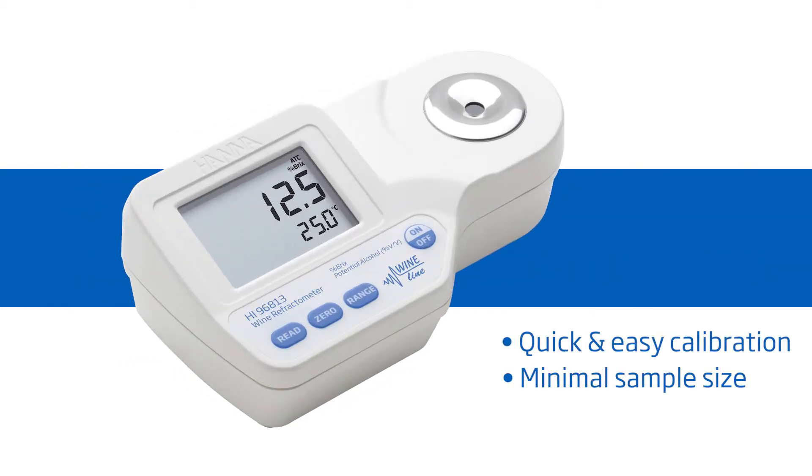It features one-button calibration, two-drop sample size, and a 1.5-second response time. Hanna Instruments provides you with the necessary tools to succeed.